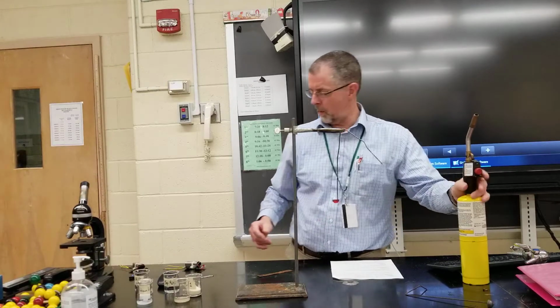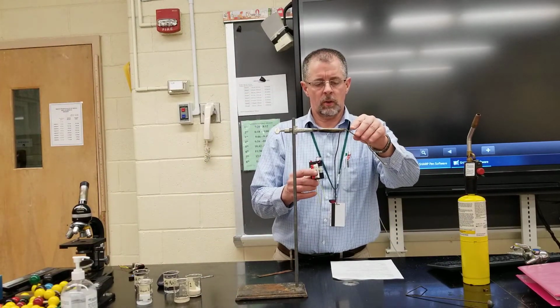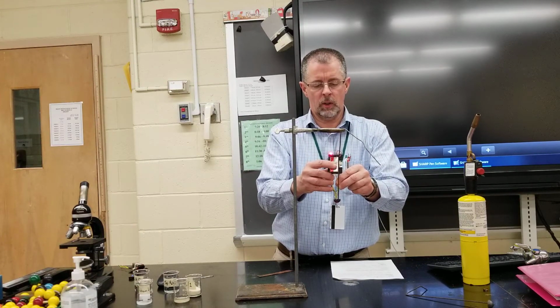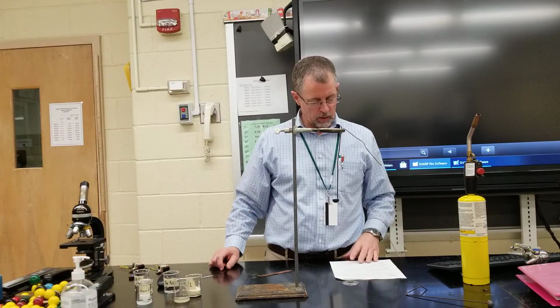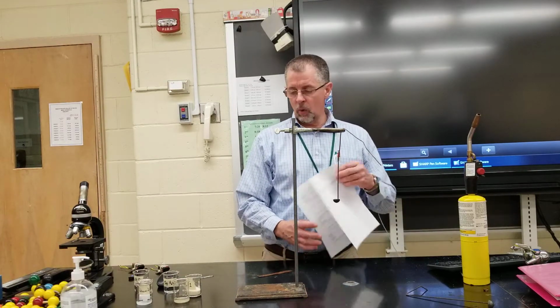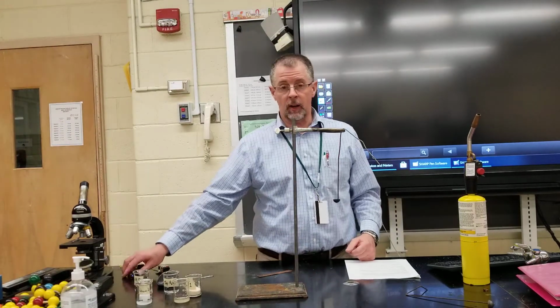So now we've got it melted, and now we're going to see if this conducts. So let's just get it in here. And we see this one does conduct when it's melted. So number 2, when we melted it into the liquid phase, it actually did conduct. Okay, so that's the data. And now what you need to do is go back, look at the data, and determine which one is the ionic substance.